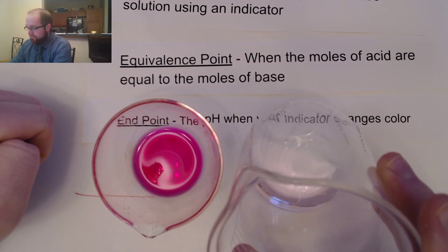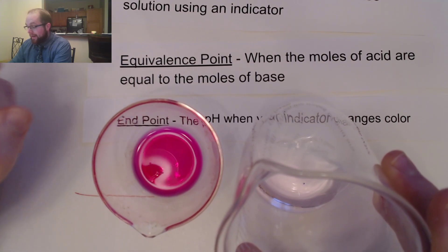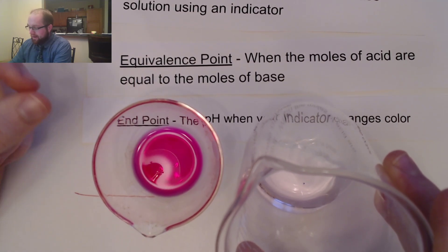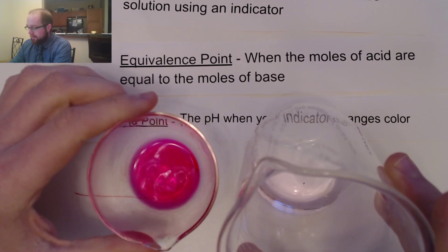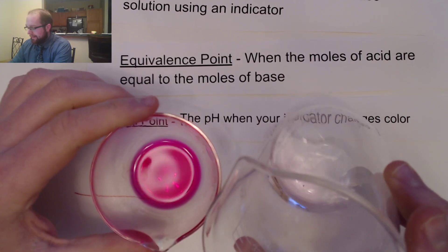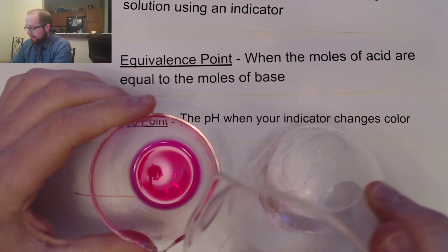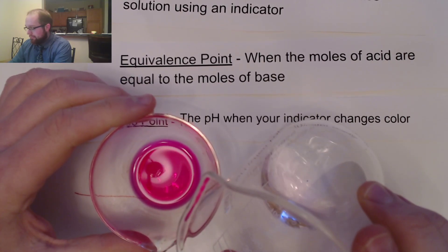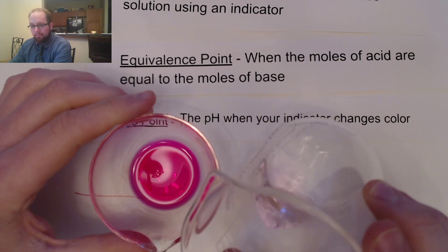I am a little too far here. If I had had a burette, you can actually direct those a lot slower, so you can get a nice light pink color — more like this, where it is perfect in between.